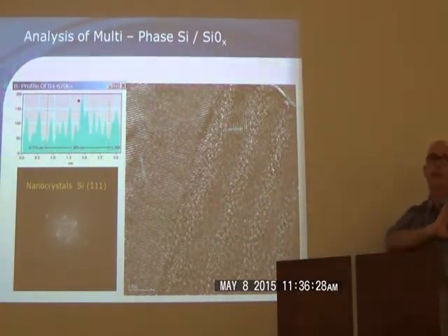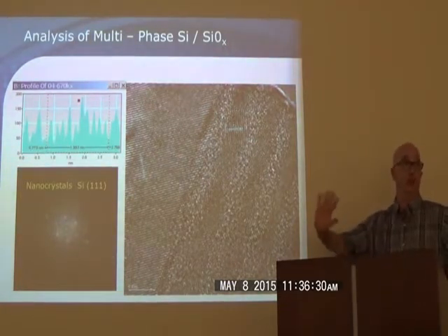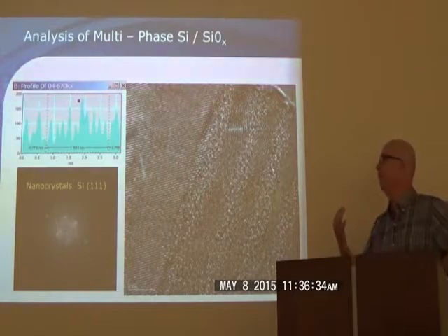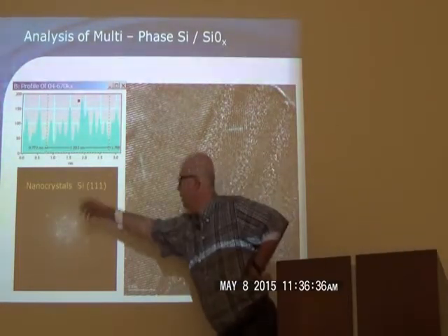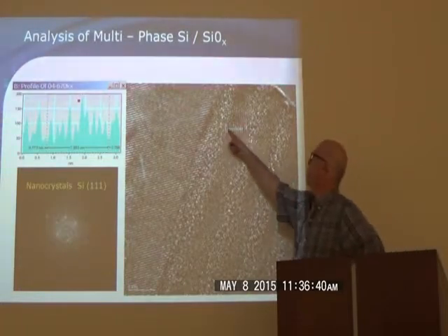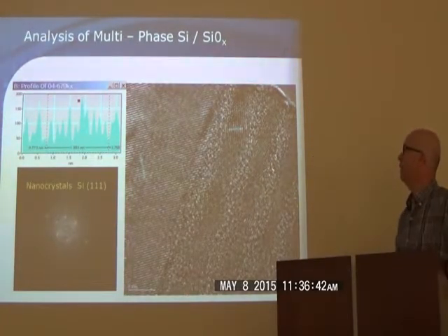And they said that opened up like a whole new direction for solar materials, which is what this material was a test bed for. And here's the FFT with a lot of information showing that indeed this is some new type of silicon that they hadn't seen before in terms of its stacking of the ions. Next slide.